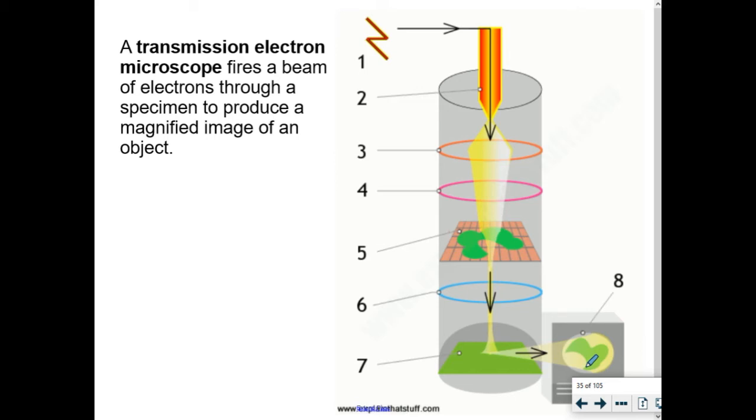If, when you're feeling with your stick in front of you, you don't feel anything, well, then feel free to keep walking, right? Because there's not anything there for you to run into. And that's more or less what this does, is that the electrons might go through.